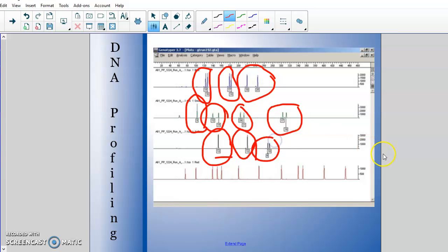So this particular genetic analyzer printout had 1, 2, 3, 4, 5, 6, 7, 8, 9, 10 STRs run in it, okay? And then you could figure out what STRs they were based on where they were located, and then you can figure out how many alleles that person has at each STR. So like at this one, the person was 17 and 19 repeats. It always kind of puts the number right underneath it.